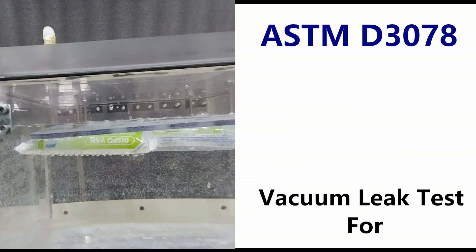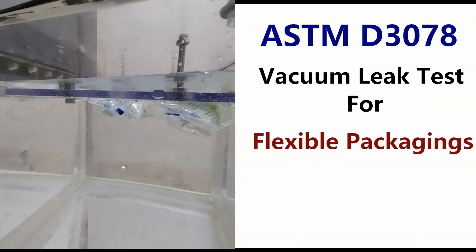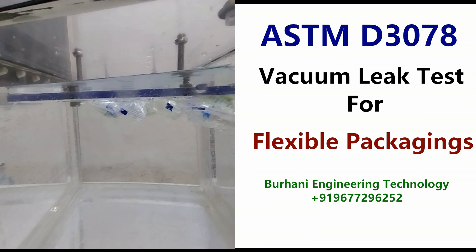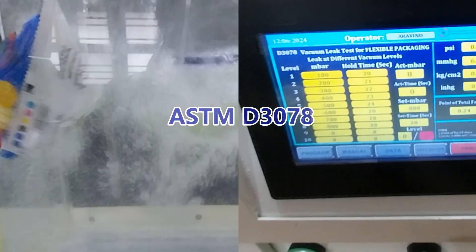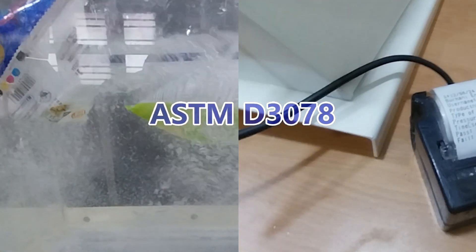This is a leak test chamber manufactured by Barani Engineering Technology for testing flexible packages for leaks following ASTM D3078 international standards. The objective of this video is to provide a clear understanding of what ASTM D3078 is and why it is used in the packaging industry.